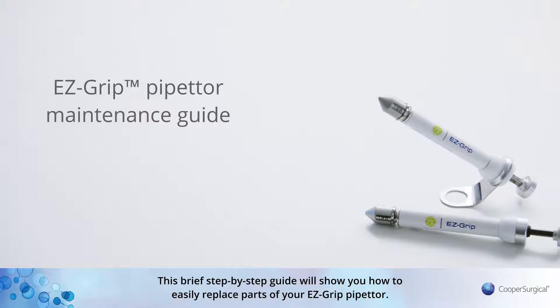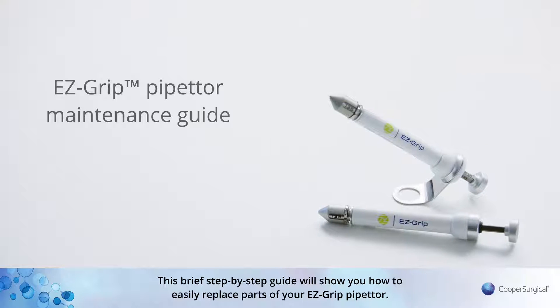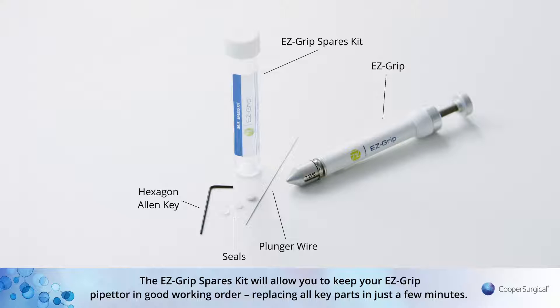Welcome to the EZ-Grip Maintenance Video Guide. This brief step-by-step guide will show you how to easily replace parts of your EZ-Grip Pipetta. The EZ-Grip Spares Kit will allow you to keep your EZ-Grip Pipetta in good working order, replacing all key parts in just a few minutes.